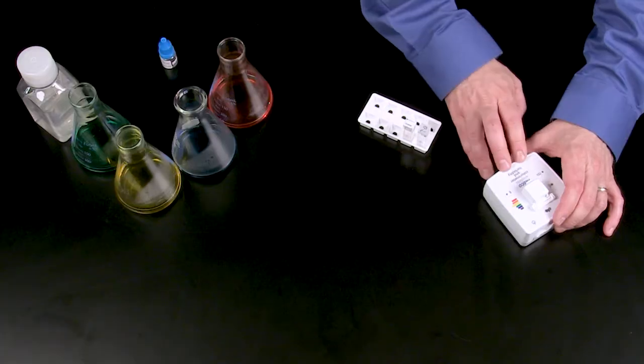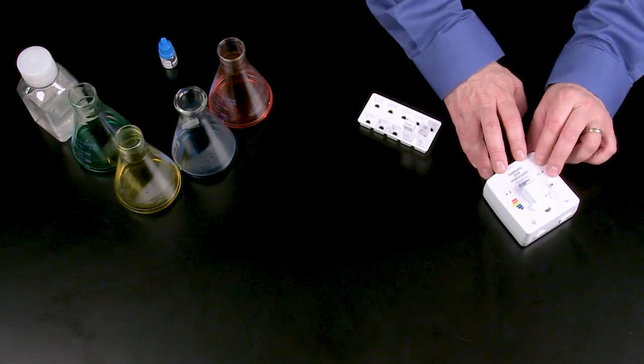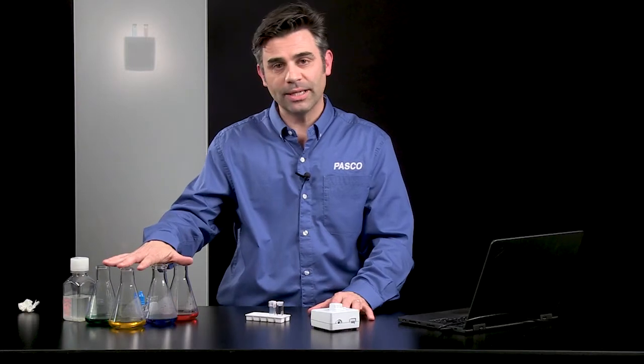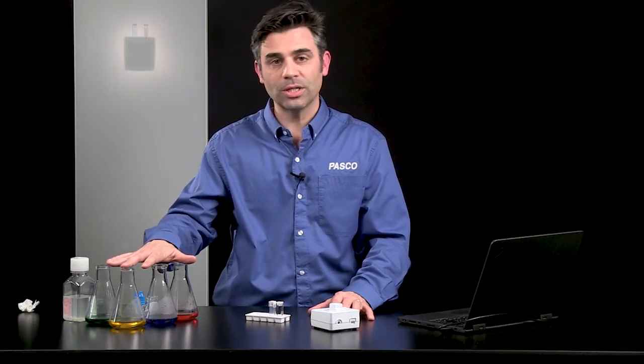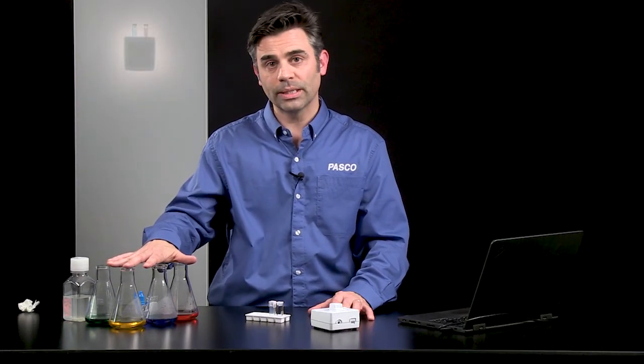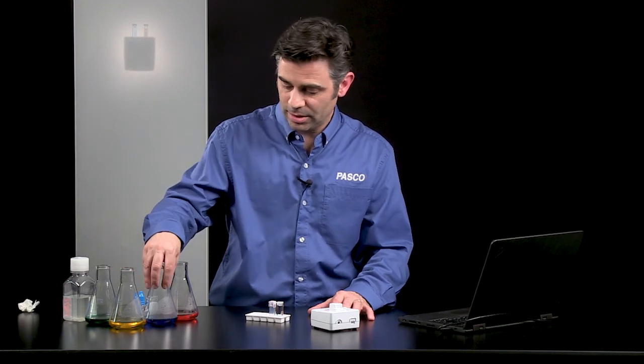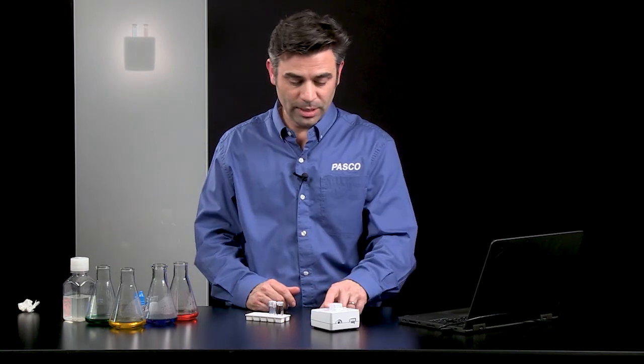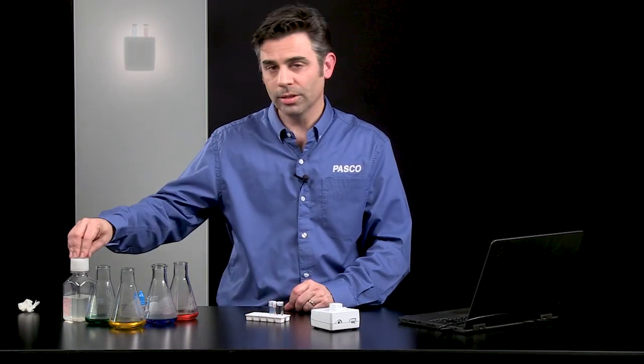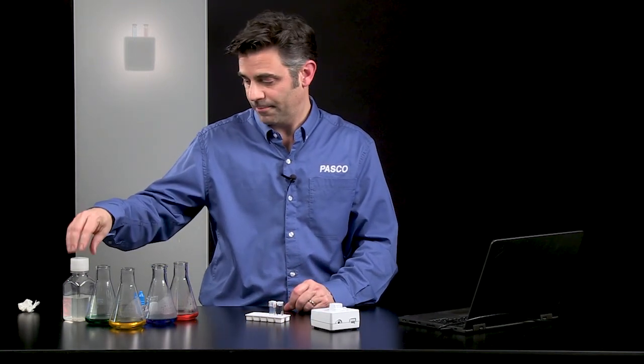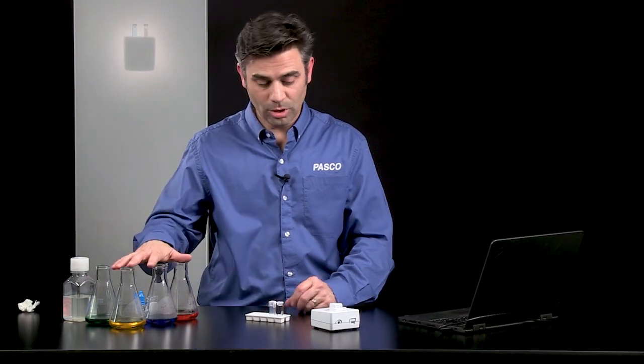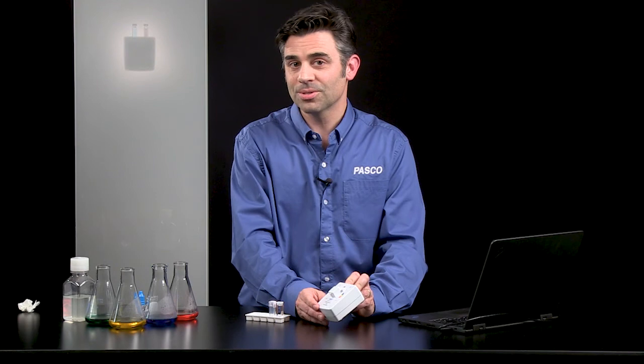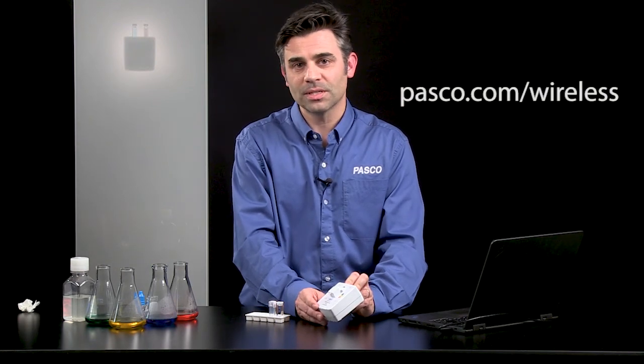And so this wireless colorimeter and turbidity sensor is great for looking at colored solutions. Applications include looking at concentration and color, and then also looking at reaction kinetics. So we can see dyes fading or reactants change in color over time. And the turbidity measurements are great for looking at the quality of water in terms of turbidity. So if you want to learn more about this sensor and any of our other wireless sensors, go to pasco.com/wireless.